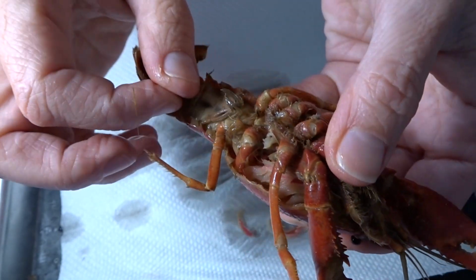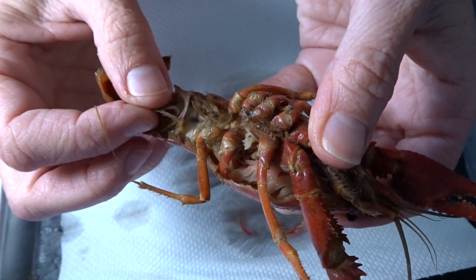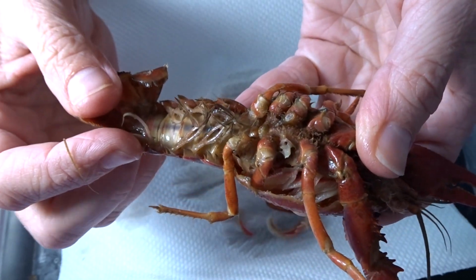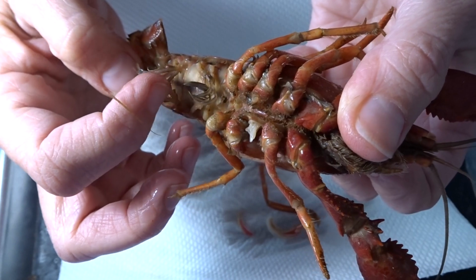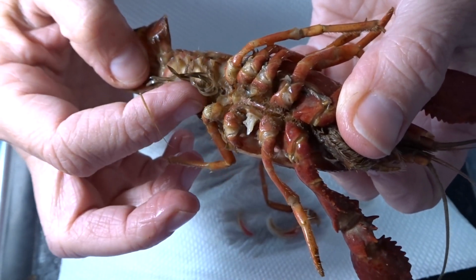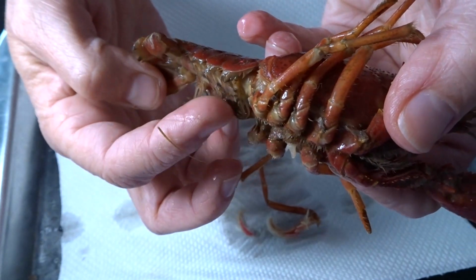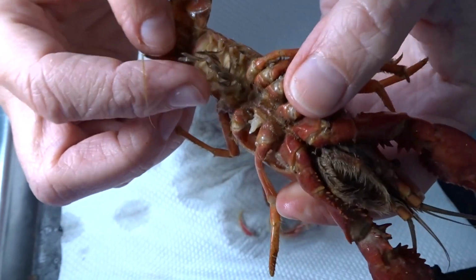Okay, so these structures down here are called the swimmerets. And how could you tell whether this was male or female just by looking at it? Well, you could tell by looking at the size of these swimmerets. They're huge, very well developed. Those are the female. That means that's where she's going to carry eggs or possibly young, and you'll see that when I show you the PowerPoint video.